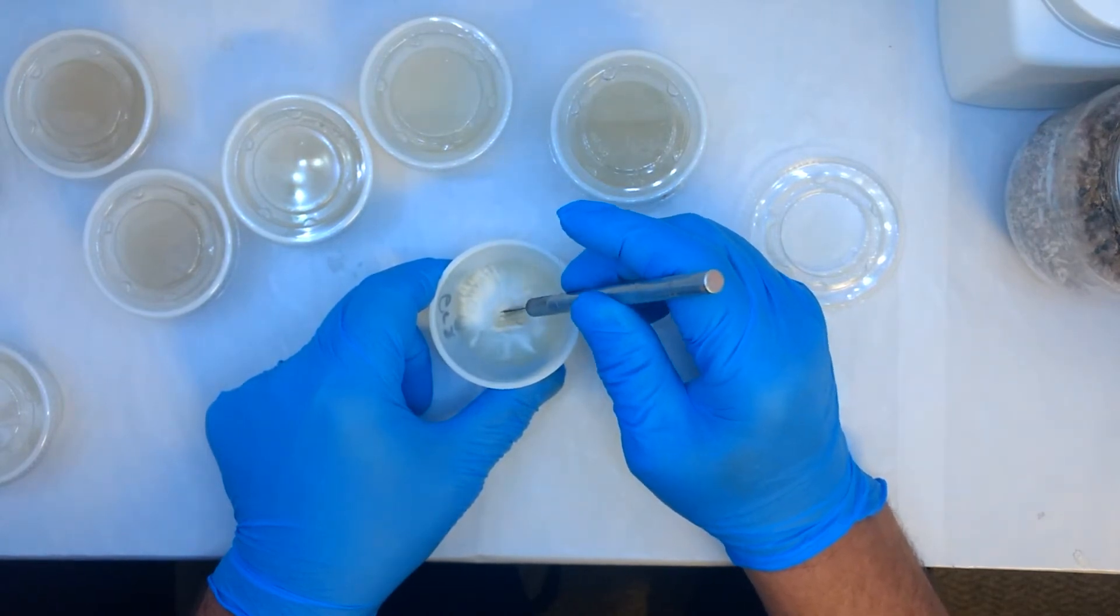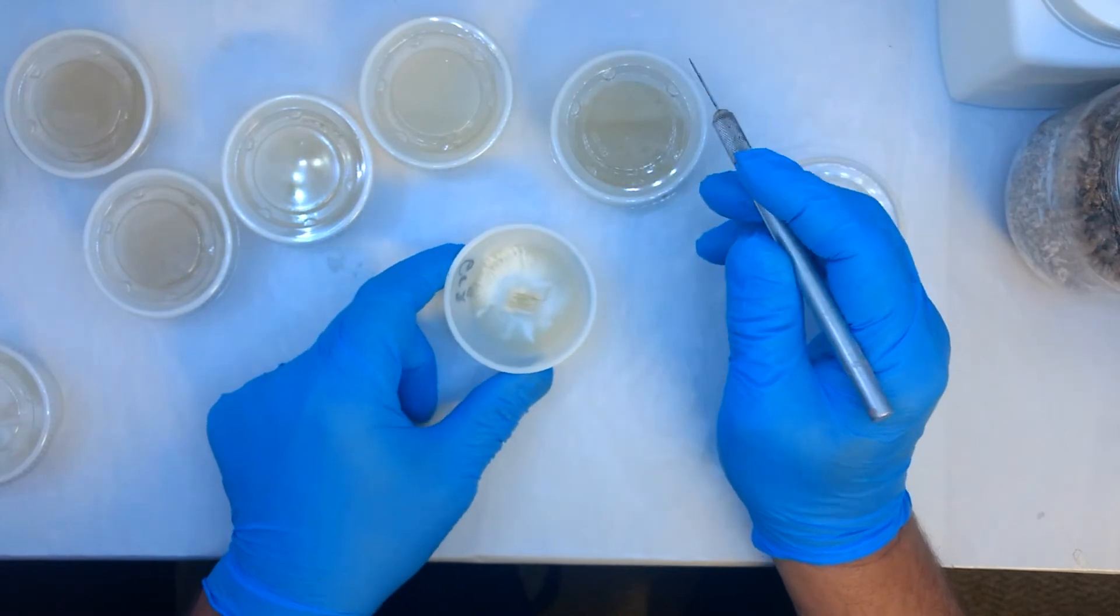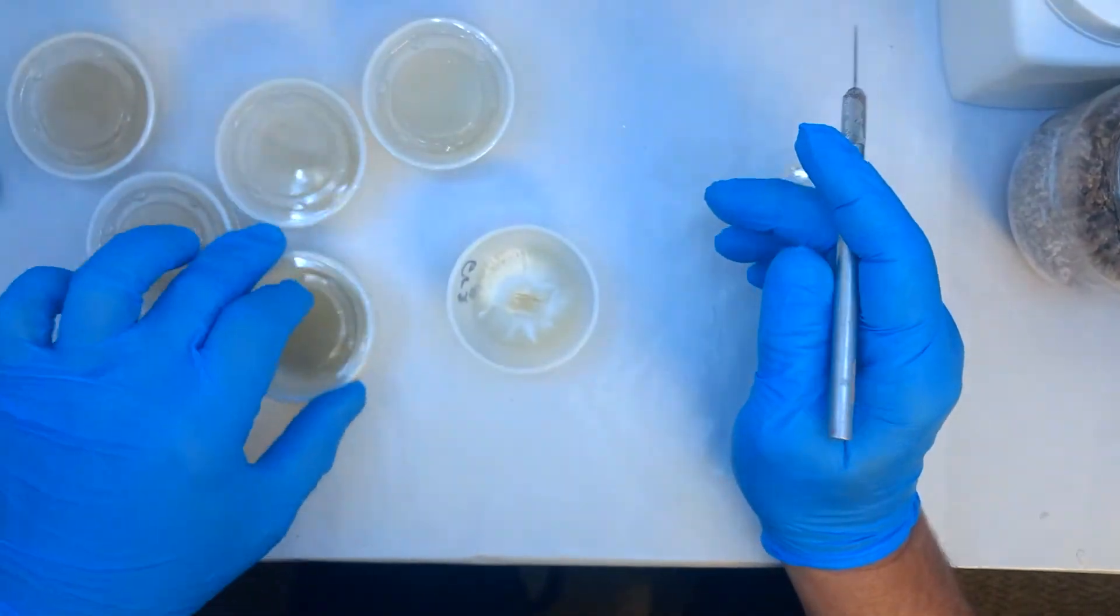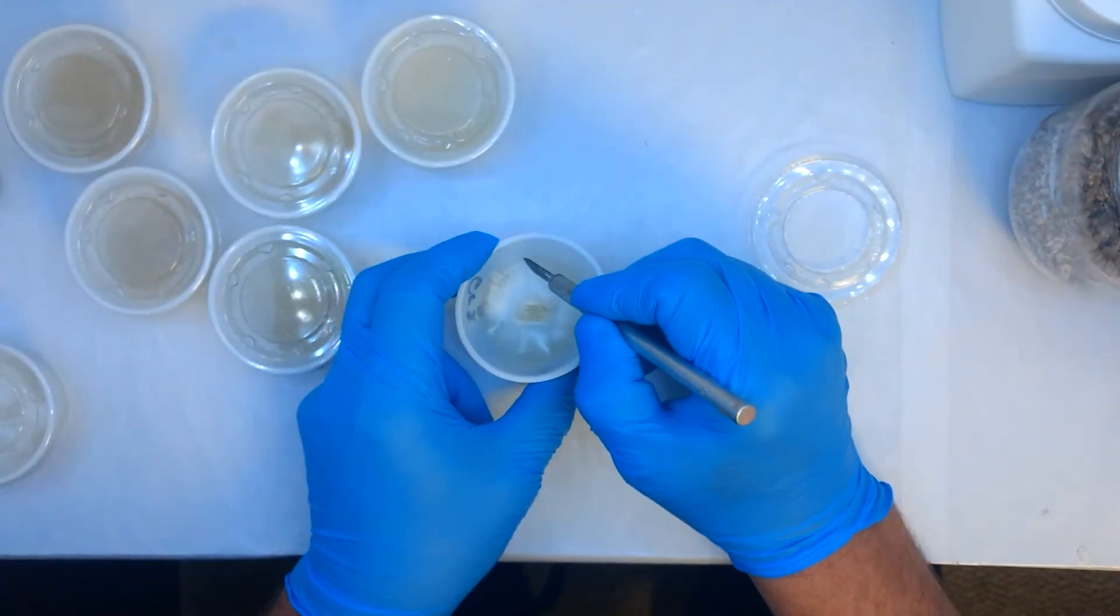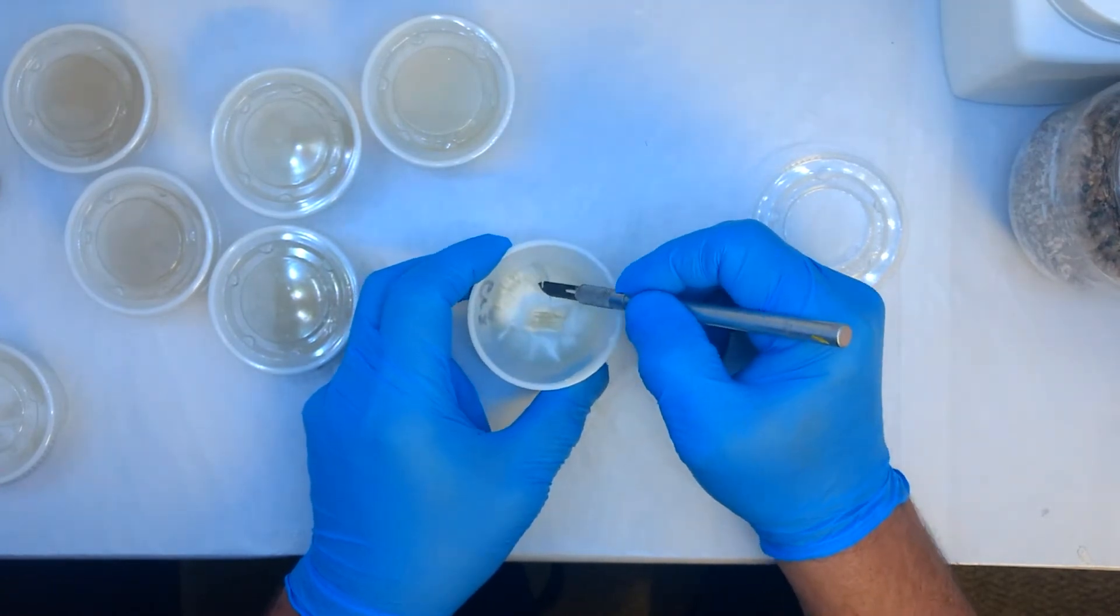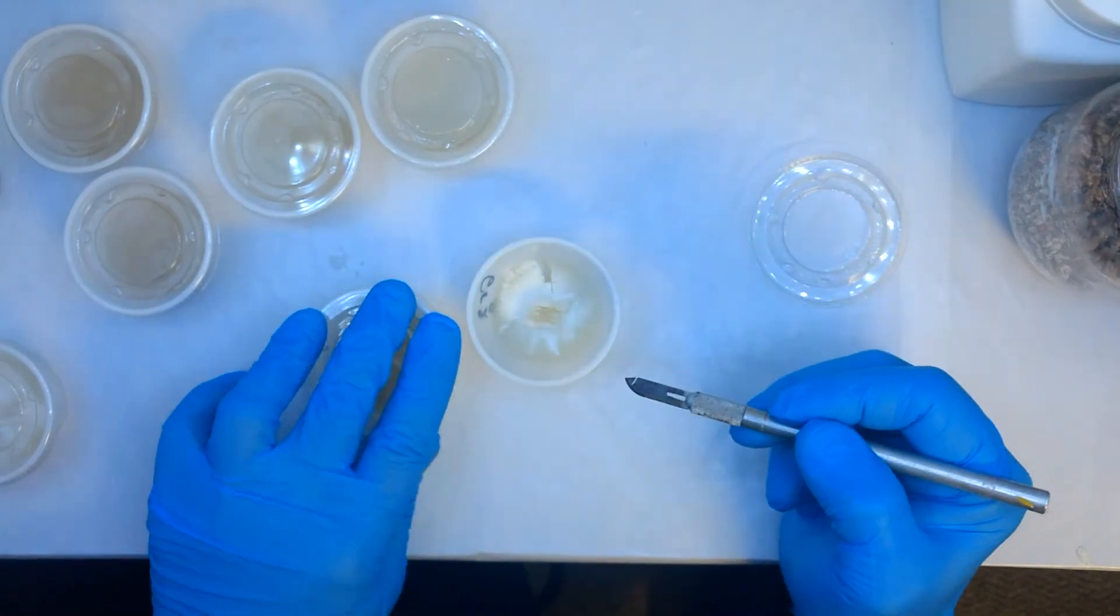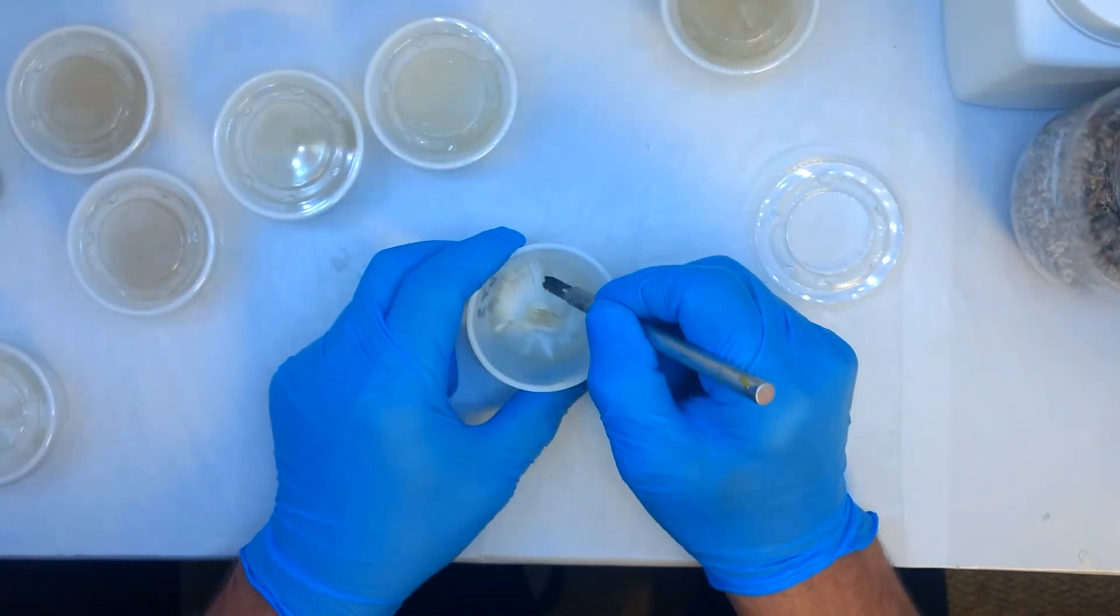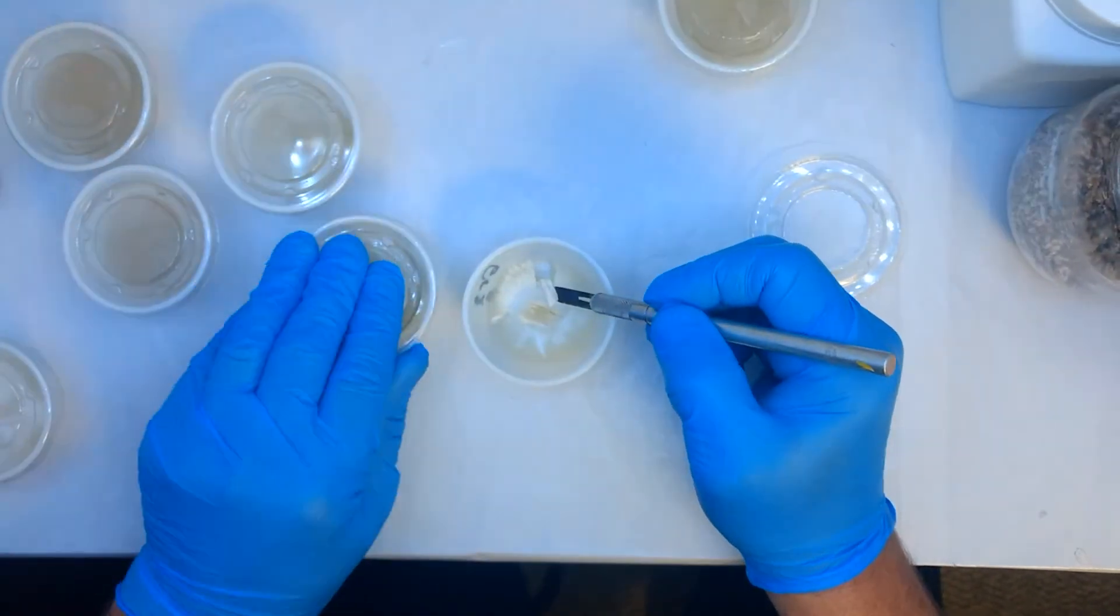Just going through the agar to cut out some chunks, place it onto the next agar dish and move along. I don't feel it necessary to have to flame sterilize your scalpel every time, but I will sterilize it here again and continue doing agar sectoring.